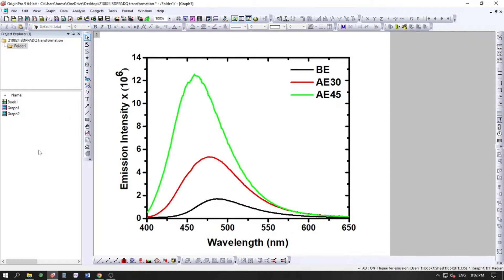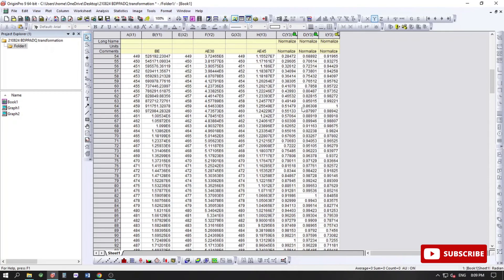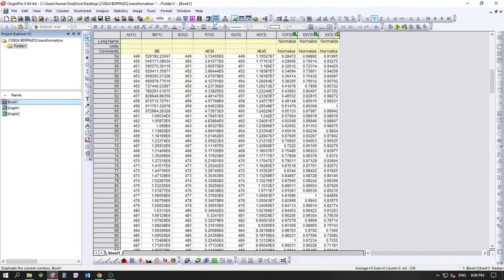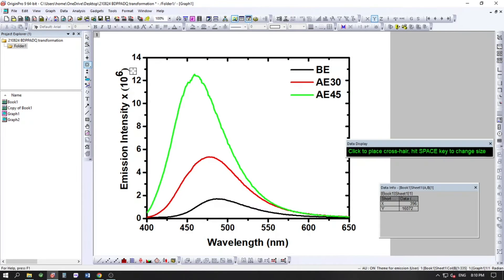Now I'll show you the second method — the manual normalization. This is the more proper method. To keep the original workbook intact, we'll make a copy by clicking the workbook copy icon. We'll do all the manual work in this copied workbook.